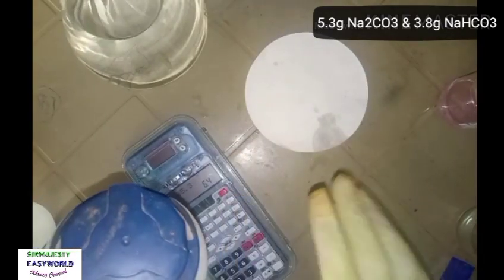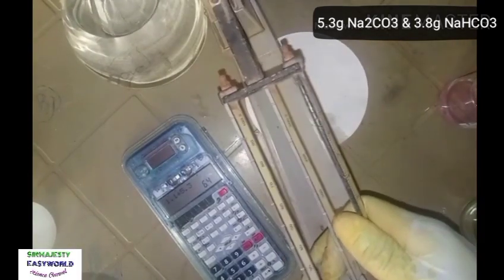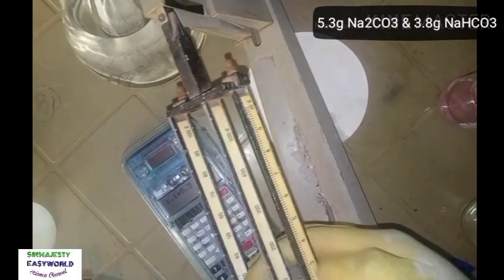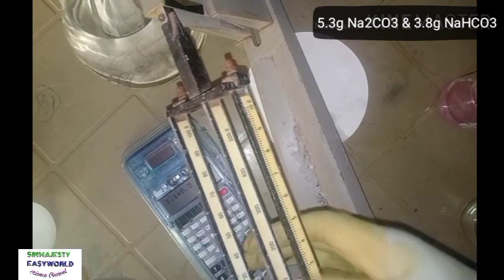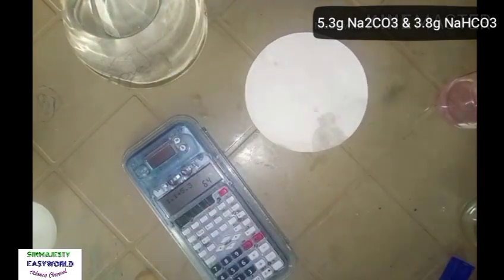But if you are using your triple beam balance, you can just take the reading to 6.4. You see here, this is our 5. You take it to 6.4 with the weight of the filter paper until this comes back to equilibrium. So that's what you need to do.